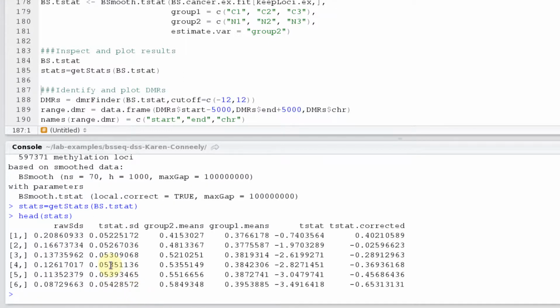And we can inspect what we got. And again, this looks like what we saw earlier. So in module 2, we have our t-statistics, both the uncorrected and the corrected. And a little bit more about what this is. I showed you in module 2 that they seem to give very different results and have different variants.